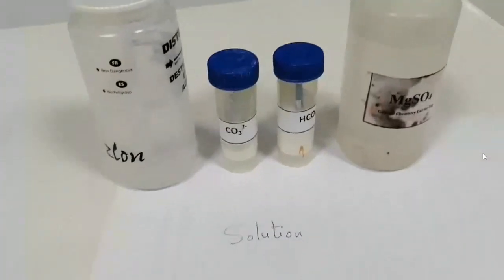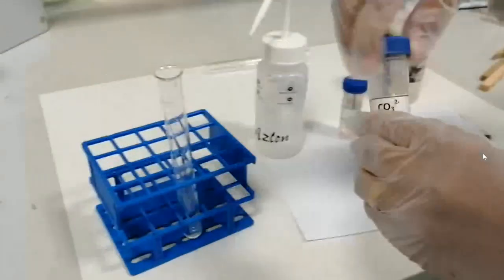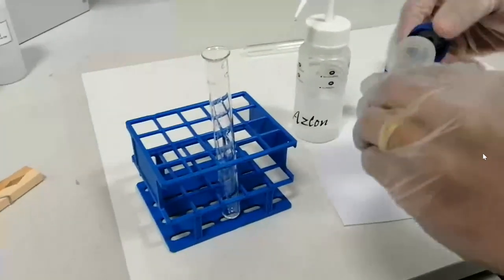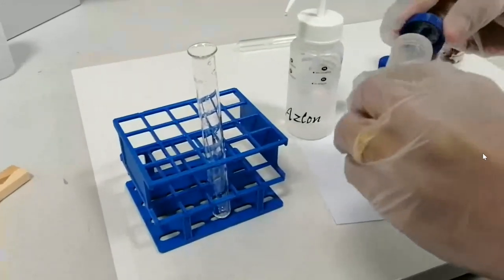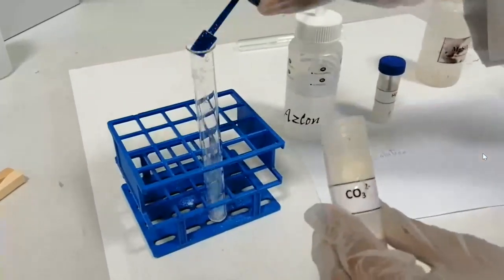That's just the reaction of carbonate and bicarbonate with magnesium sulfate. First, you have to prepare a solution, and you know how to prepare a solution. Just a few crystals plus water. Mix them very well, and then add the reagent to that solution.